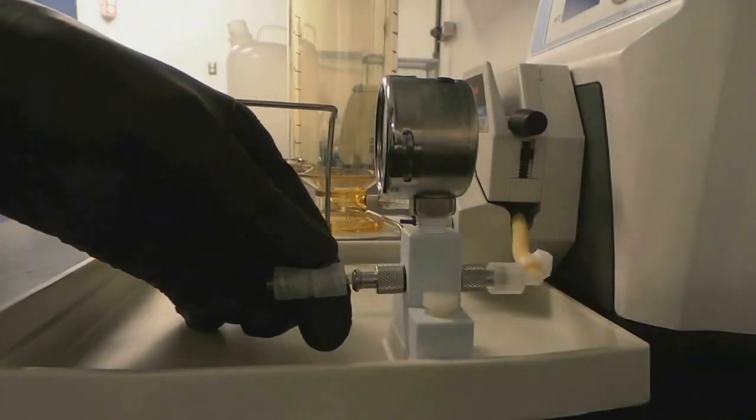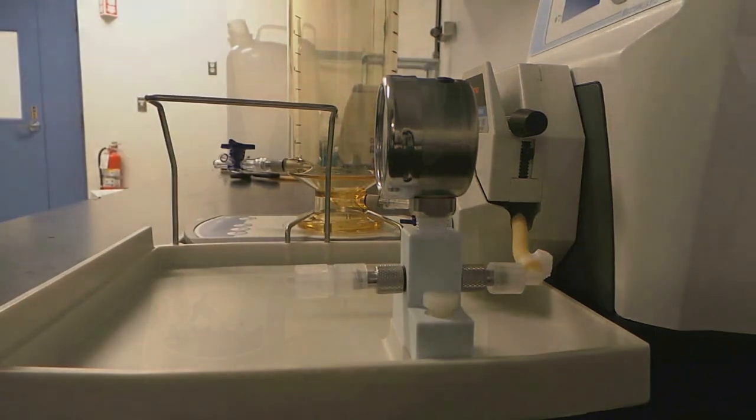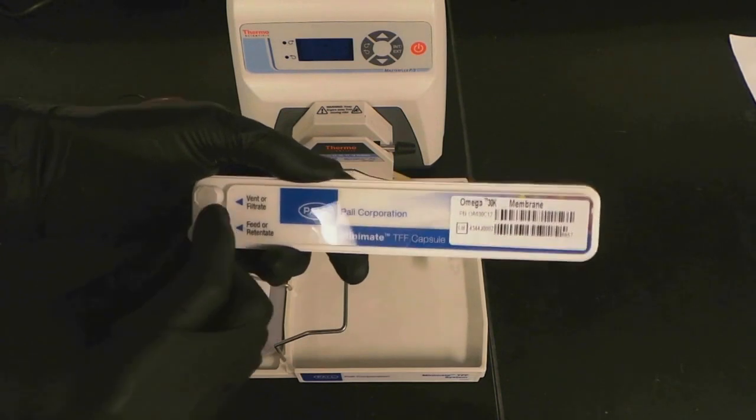Attach the lure coupler to the other side of the pressure gauge, and then attach the feed retentate port of the MiniMate cassette to the pressure gauge.